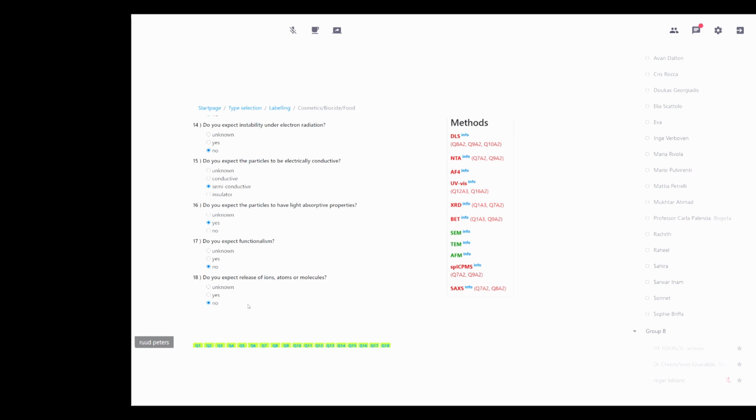In this case, we used TEM to analyze the materials and found out that they were small titanium dioxide particles with sizes around 10 nanometer, and larger zinc oxide particles, which had sizes around 150 nanometer. Not knowing this beforehand, we also used different methods. We also used single particle ICP-MS and found particle sizes in the range of 30 to 50 nanometer, which is not the actual size, but probably the size of the aggregates found by the single particle ICP-MS.